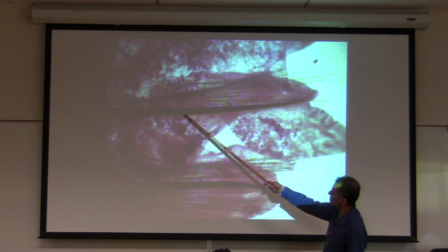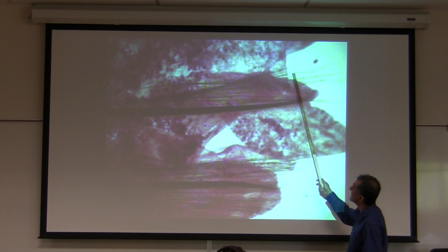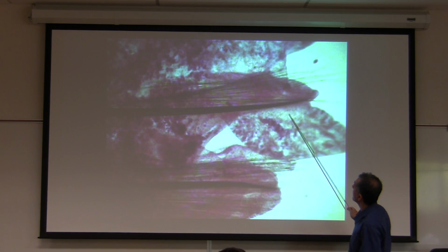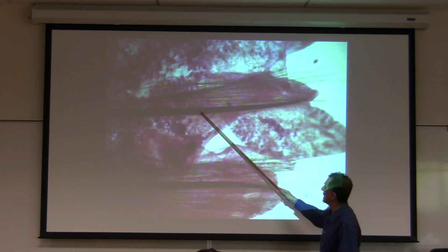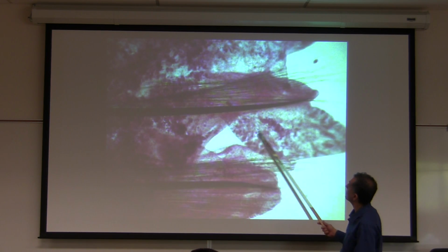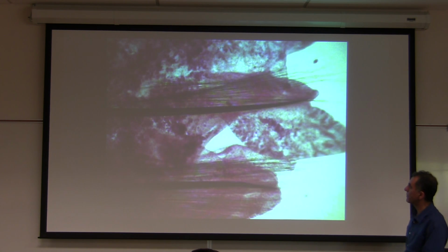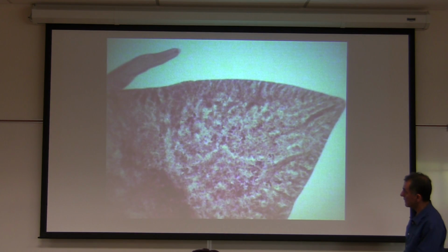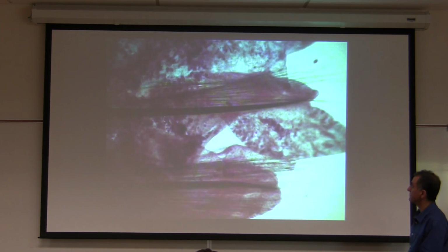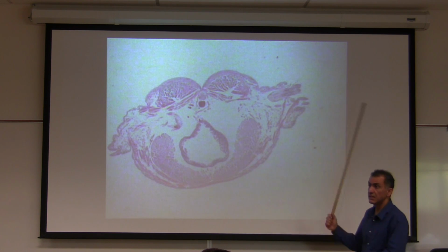What is the name of structure? Aciculum. What is the name of these structures? Setae. And then most of this is notopodium. On the bottom you have neuropodium. Again, this is not very good, but on your slides you can tell them apart. On this slide I just took the picture of a notopodium, but on your slides it's better. Here we go.